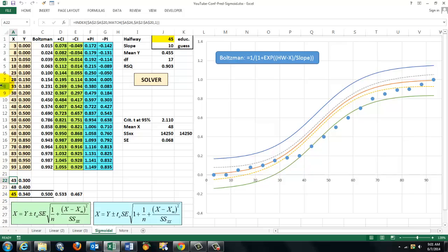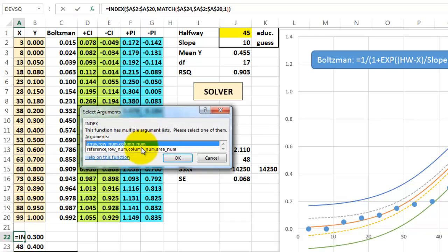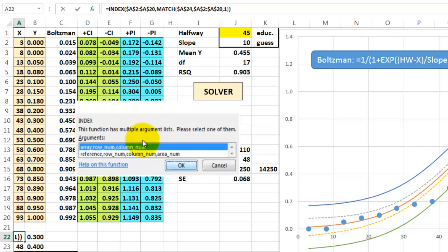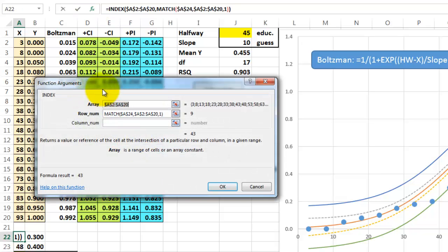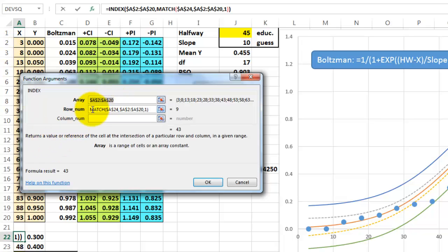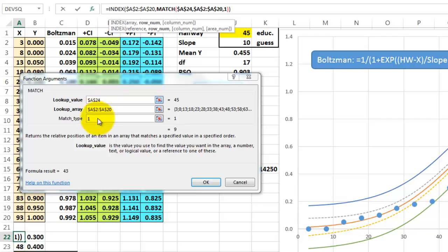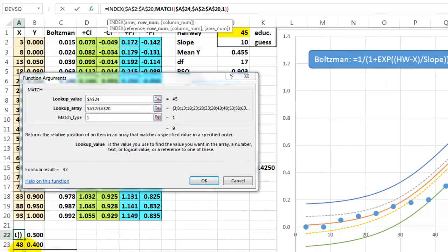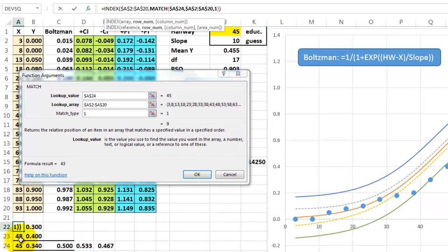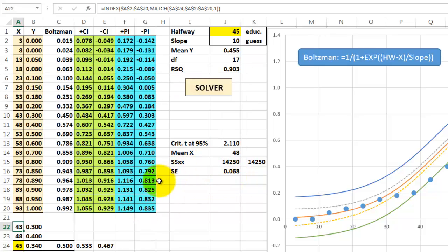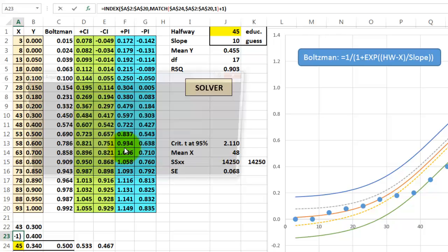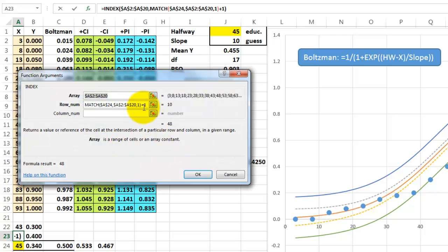And I say to index in the range of axes, find a match for a24, which is that halfway value, in the range a2, a20, and match type 1, that means I want to find the previous one in an ascending order. What is the next one? It is the same formula. The only difference is that this time I have to say plus 1. I want the next one.